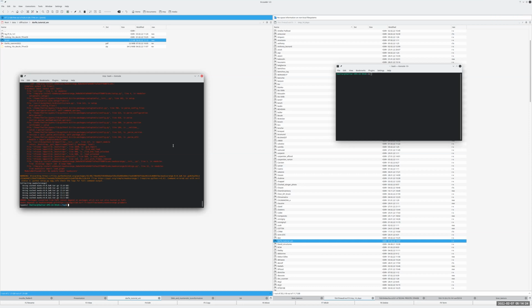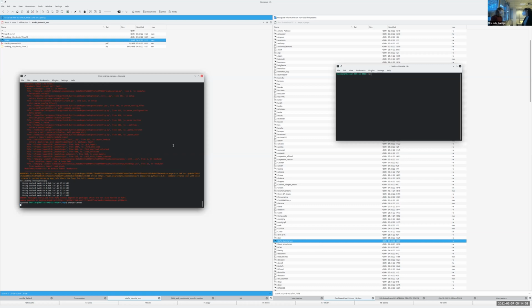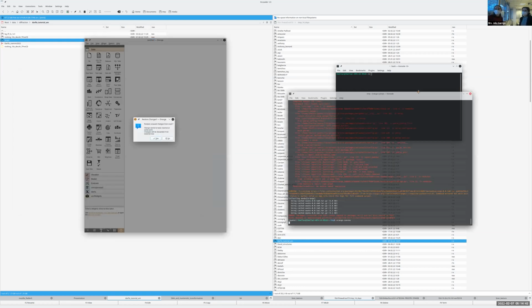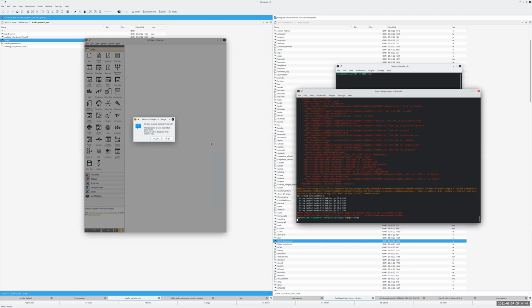For now, I will use the old version. Is there any problem with it? No, but we don't know if you're gonna be able to save any data anywhere. Yes, probably the folder will be created automatically. Yes, exactly. But you might not have all of the widgets that we are gonna use. Okay. Thank you. Anyway, I'm gonna go back to sharing screen and we will finish showing the example.